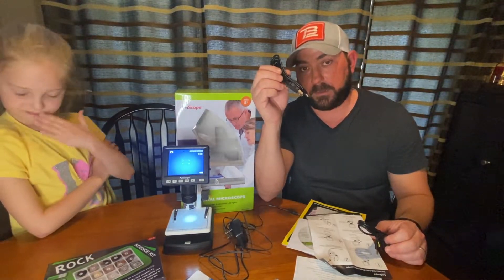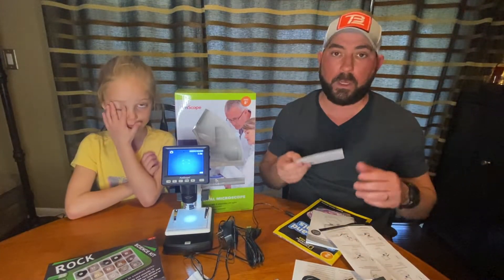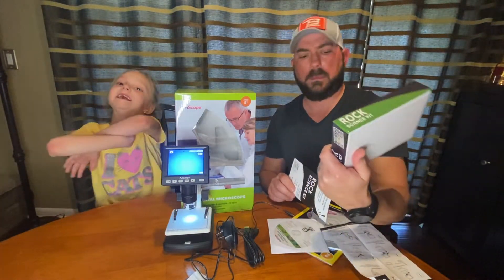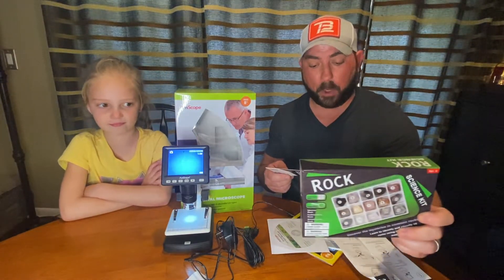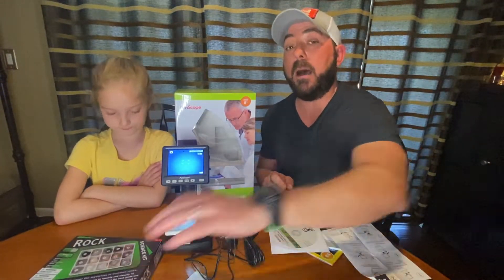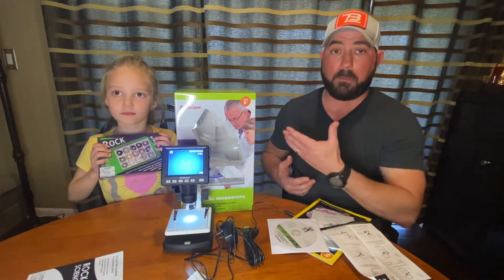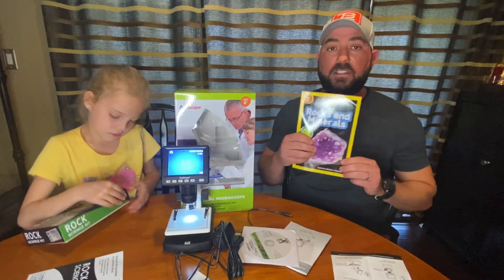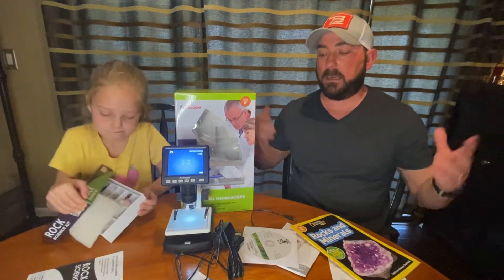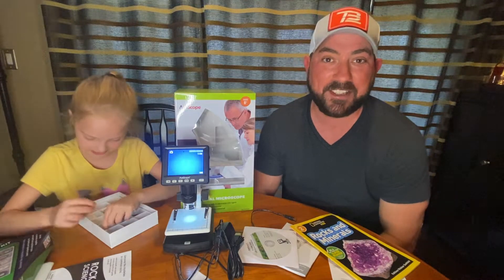You can also hook it up on your computer — it has a program you download and you could do really neat things. It comes with a science kit of about 15 rocks, everything from granite to slate, marble, and limestone. I'm eager to go outside and see if we can find some bugs, maybe some grass. We'll do some rocks. There's just so much that this came with — it's really impressive. Fallon's finding some rocks already, so let's see what we got. Let's check this thing out and power it up.